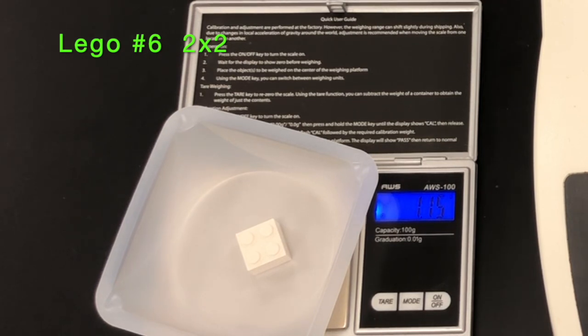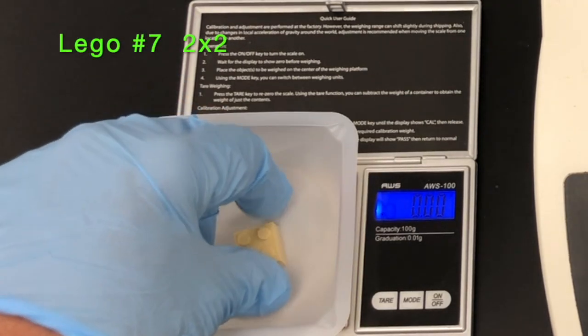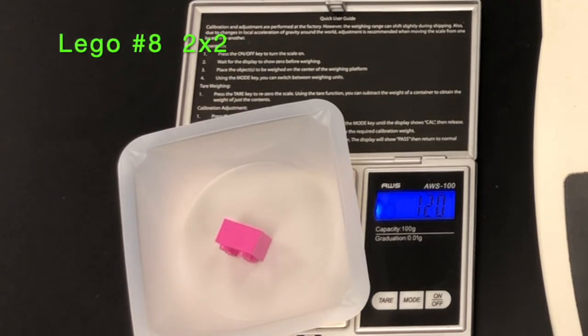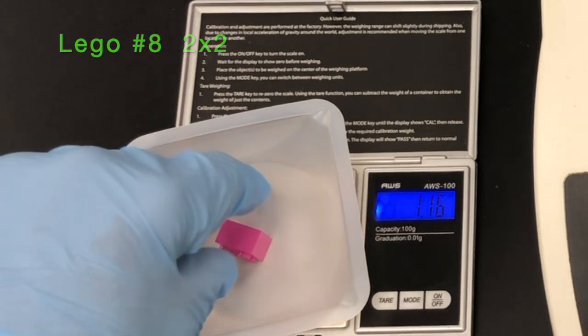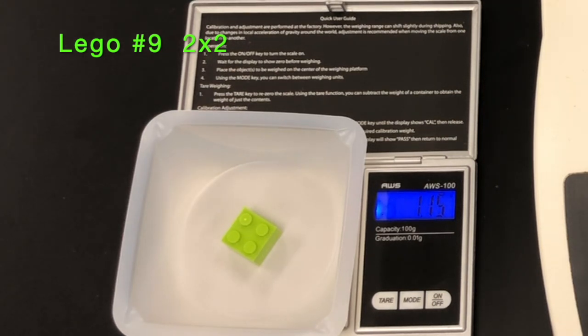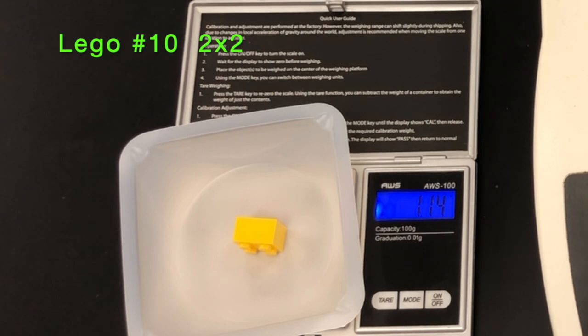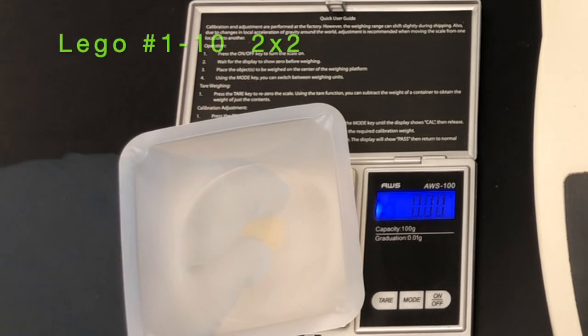Here is lego brick number six, then number seven, number eight, number nine. In the next segment you will see all ten bricks connected together, and the total mass will be displayed. Divide that total mass by ten to get the average mass of one two-by-two brick for use in your calculation.